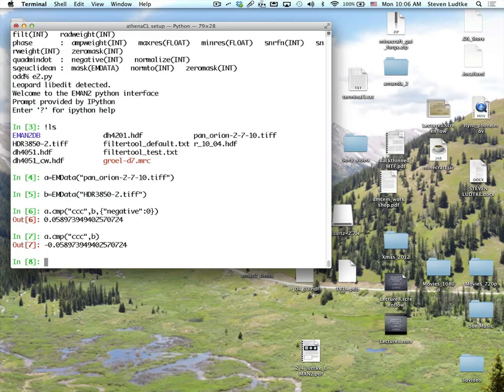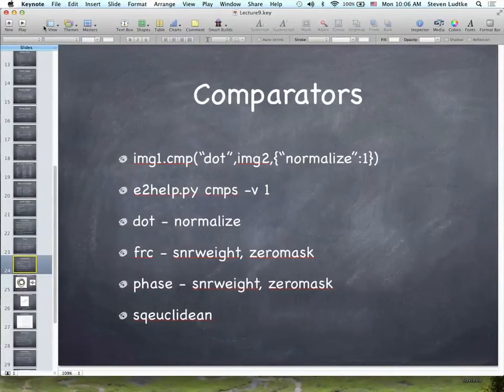And the reason you have that convention is because other metrics, like, for example, if you take the difference between the images and compute the variance of the difference, the more similar the images are to each other, the smaller that value will get. So most of the metrics that you would normally use are measuring how different things are, so the smaller the differences are, the more similar the images are. So if there are any metrics that you use that would normally return a larger value, they get inverted by default, but you can turn the behavior on and off. Probably more detail than you needed.